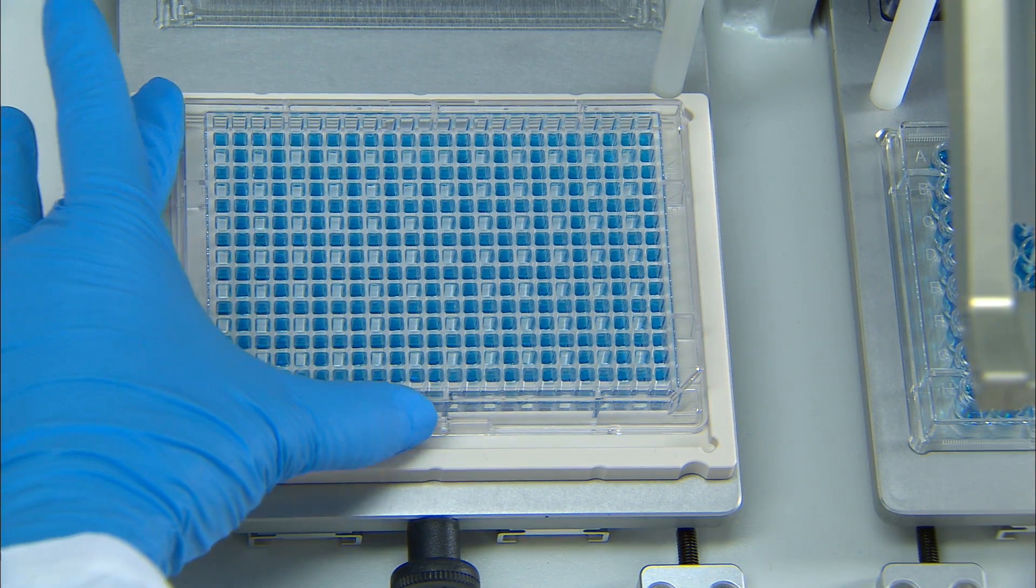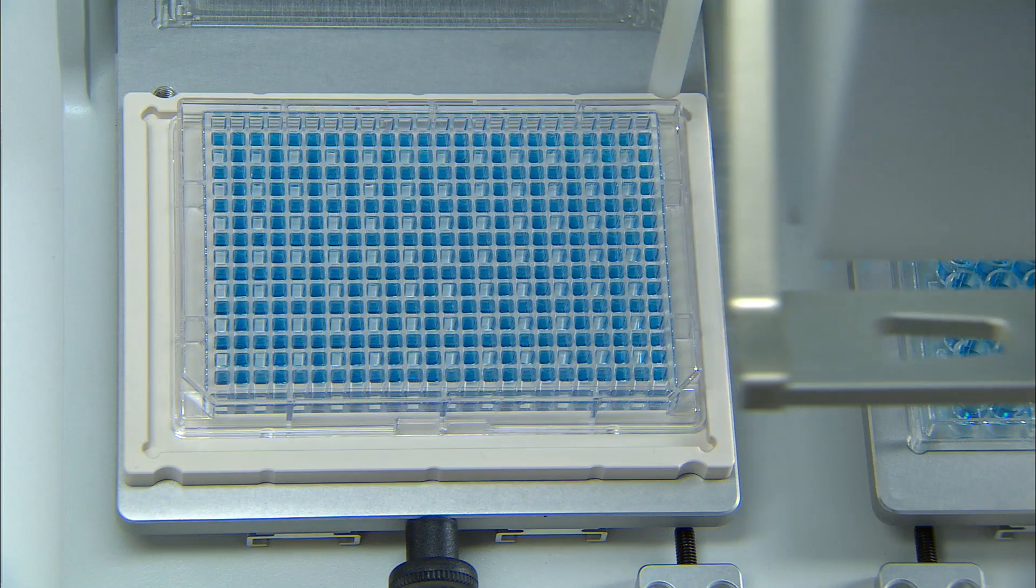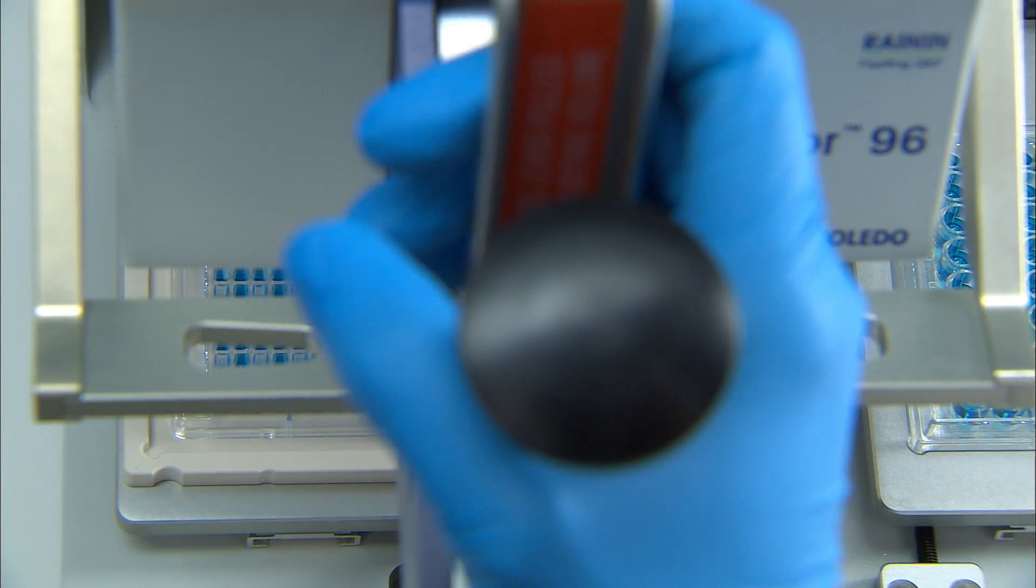The third cycle is now complete, and the plate is pushed to the fourth and last corner for filling the last set of 96 wells.